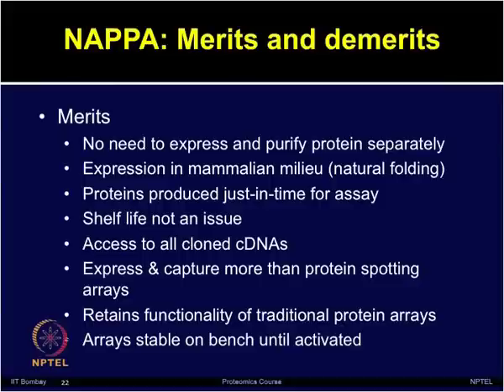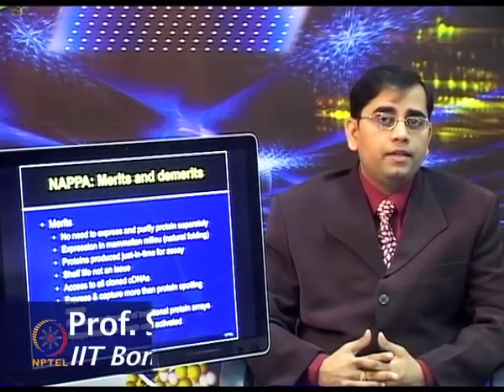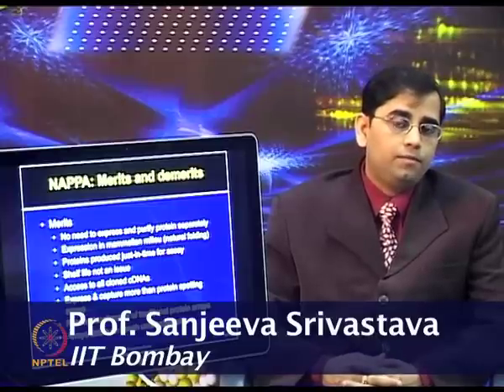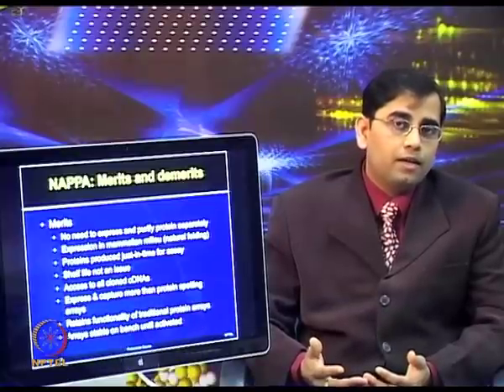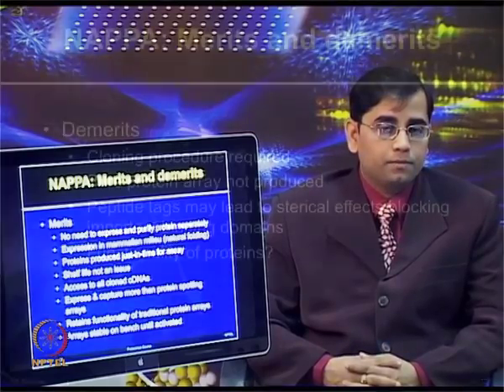Now, comparison of protein synthesis from NAPPA chemistry with the traditional purified protein arrays has demonstrated that expression and capture can be achieved more by using NAPPA chemistry. The NAPPA approach retains all the functionality which one can use by using traditional protein arrays, and adds strength to the system. The storage on the bench is one of the very major achievements of the NAPPA approach.